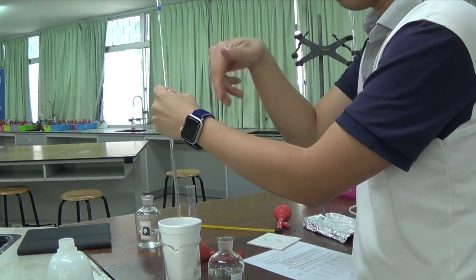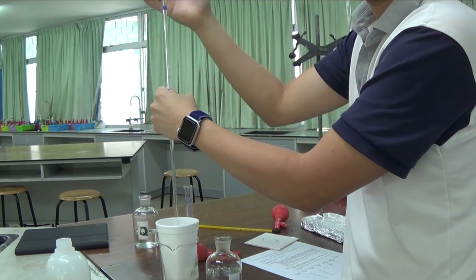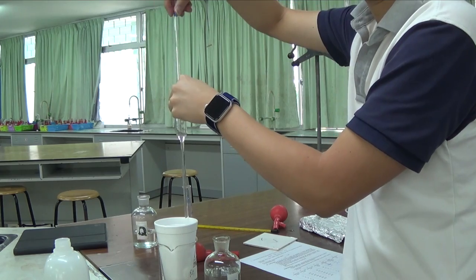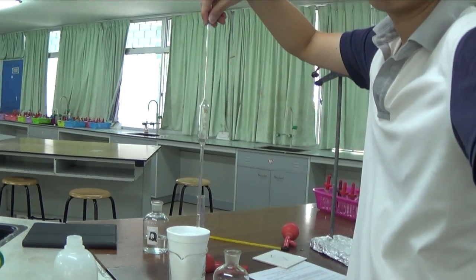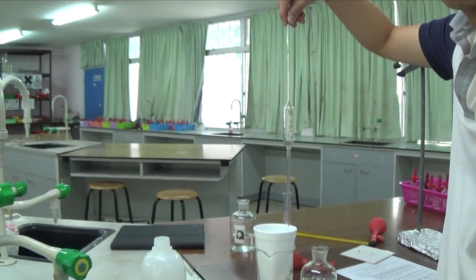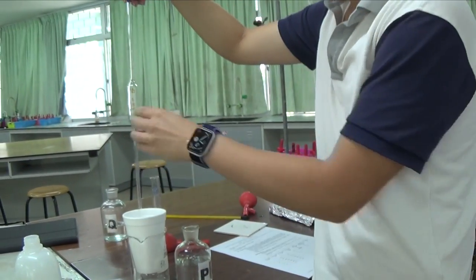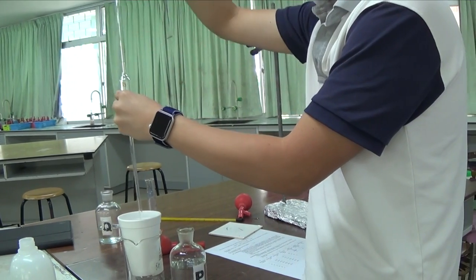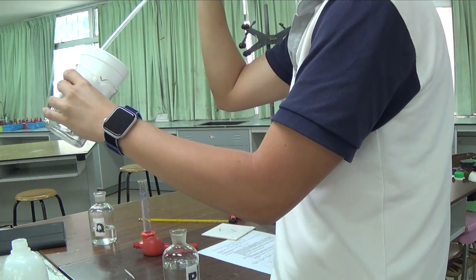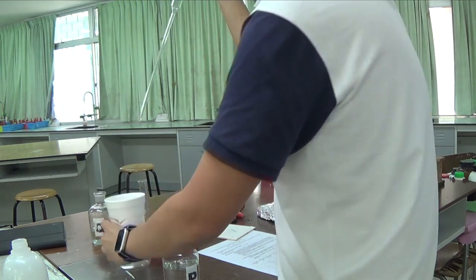So what we do now is we just take out the pipette feeder without ejecting. So once you take it out from the bottle, you don't want to suck in anymore because you're just sucking air. So make sure you press eject while you slowly twist. Hang on, just give me a minute. Okay, so we slowly twist out the pipette feeder. And that is 1, 2, 3, 4, 5.